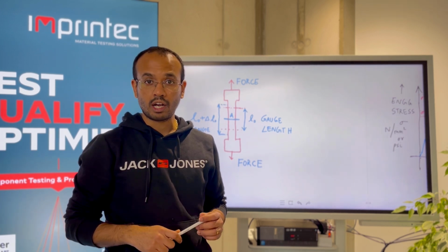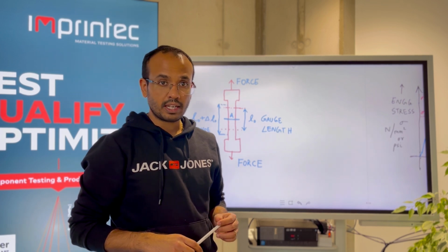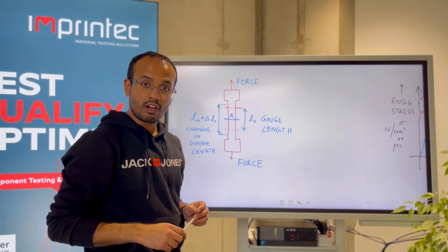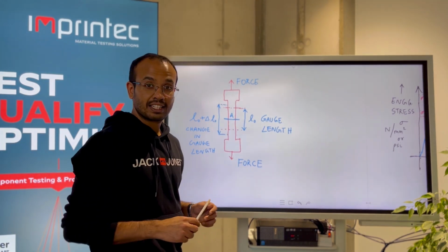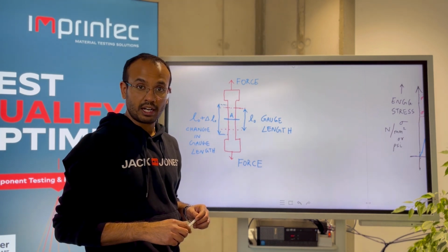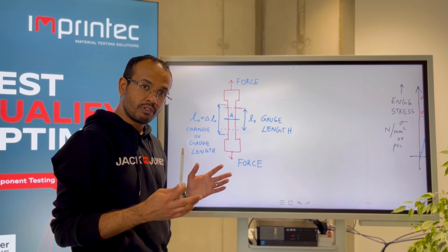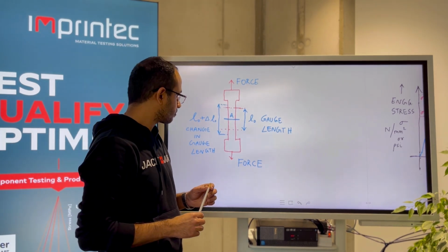Have you wondered how engineers really do material testing? Today, I take you through the fundamentals of the gold standard of mechanical testing or material testing called tensile testing, otherwise known as tension test. This has been the conventional way of doing testing for the last 100 years.